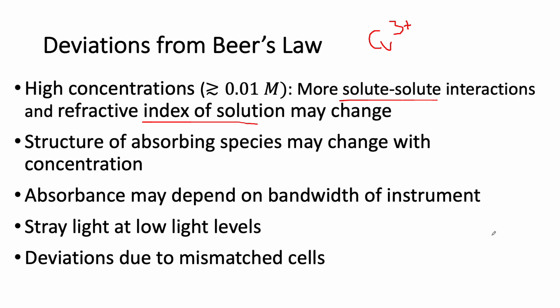And on top of all this, it's just very difficult to measure very low light levels or very high light levels. I'm going to go back to transmission, because I don't get confused with transmission. If you have 100% transmission, that means you have the same amount of light going through as you had for your standard, your empty cell, say. If it was in water, pure water, you put pure water in there and you measure the transmission.